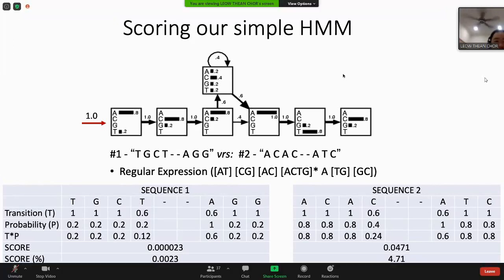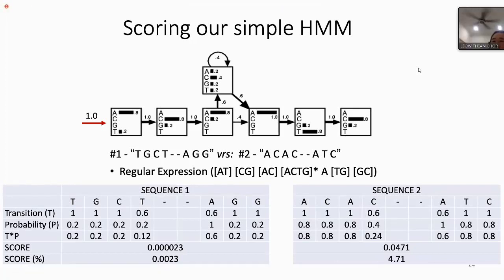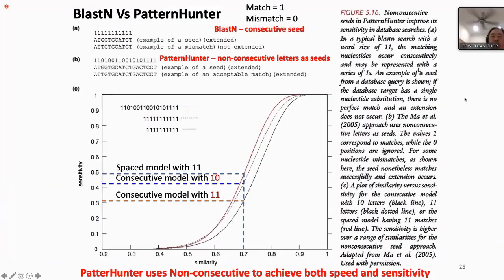Sequence 2. Yeah, the higher the score, the better match, right? So sequence 2 is very simple. Okay, sequence 2. Okay, we move to the next one.